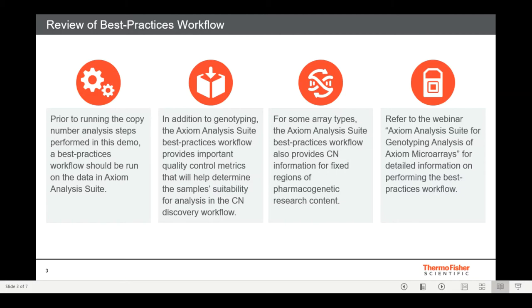In addition, for some array types, such as the Precision Medicine Diversity Research Array, which we will be using in this demo, the best practices workflow also provides copy number information for fixed regions of pharmacogenomic content. I'll show an example of this a little later in the webinar. For more information and a tutorial of the best practices workflow, please watch our other webinar, Axiom Analysis Suite for Genotyping Analysis of Axiom Microarrays.